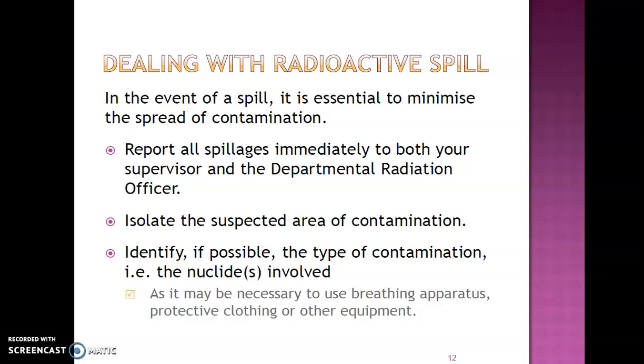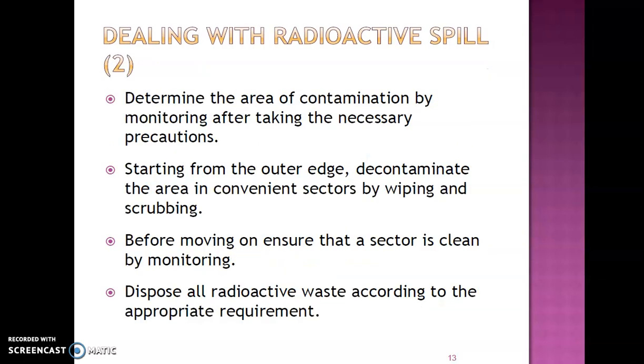Identify, if possible, the type of contamination, for example the nuclides involved, as it may be necessary to use breathing apparatus, protective clothing or other equipment. Continue. Determine the area of contamination by monitoring after taking the necessary precautions.